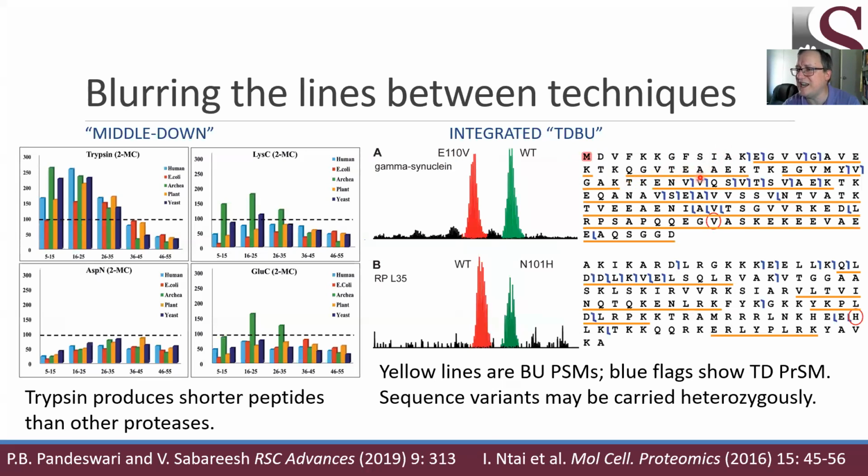But we also have these yellow lines. These yellow lines represent parts of the protein sequence that were identified through shotgun proteomics. We have peptides that span across these entire yellow regions. So that's brilliant. We like having all that data. By being able to play them off of each other, we're able to ask how strongly we can support our identification of this particular E to V variant.